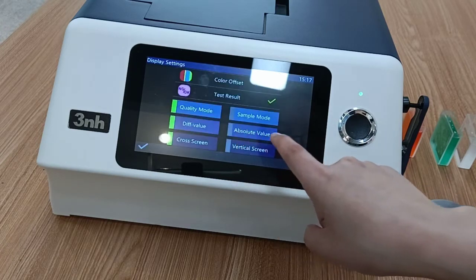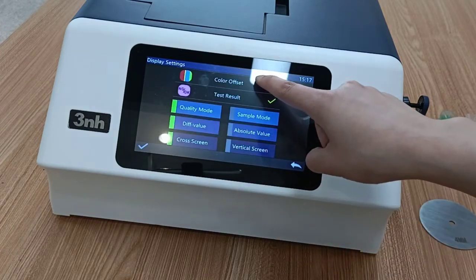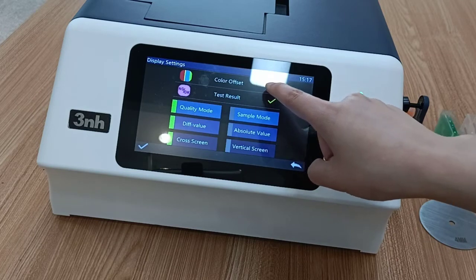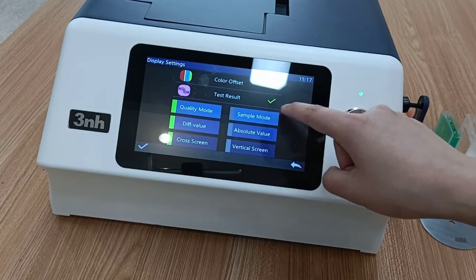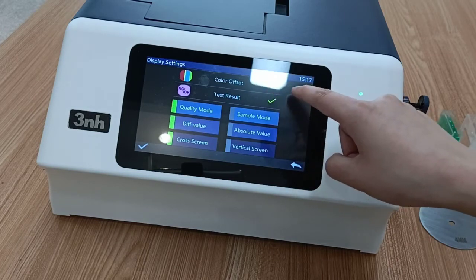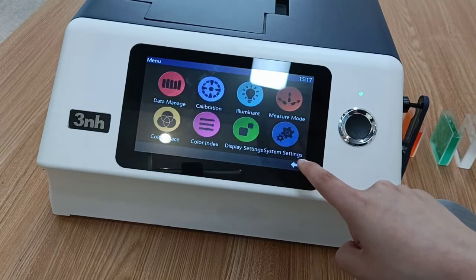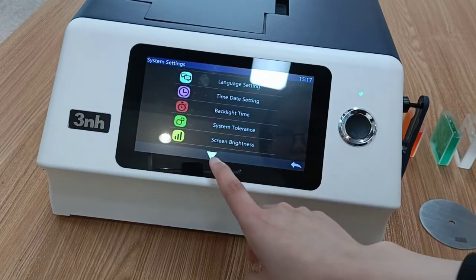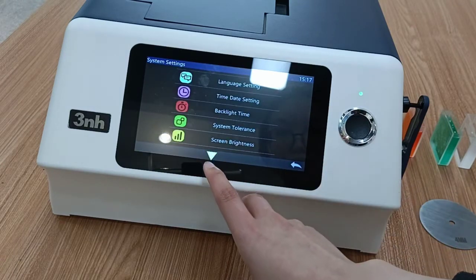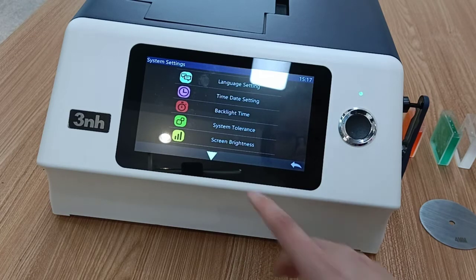And here are the display settings — color offset and test result. We need to select these two functions. And here are the settings of the system.